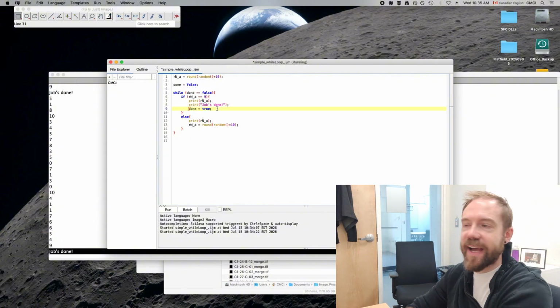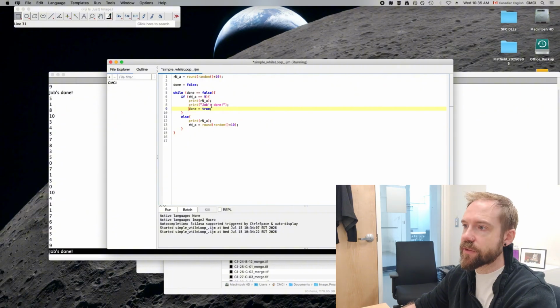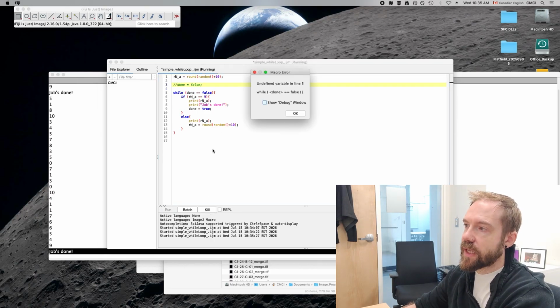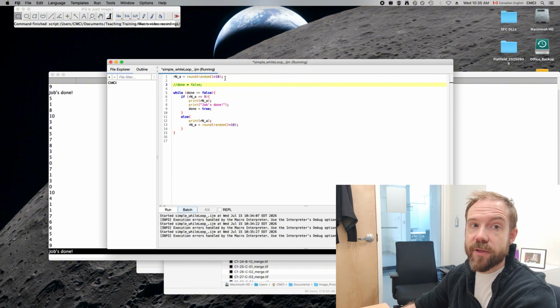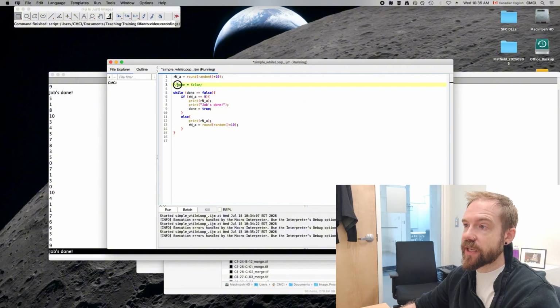You're going to be upset if that happens, particularly if the analysis takes a long time and you find out you've actually just been analyzing the same cell 500 times. If I don't initialize this condition to check, then when I run it, it's going to give me the undefined variable. So unlike a for loop, where you instantiate the iterative variable within the actual for loop language, within a while loop, you have to instantiate a variable to check outside of the loop.